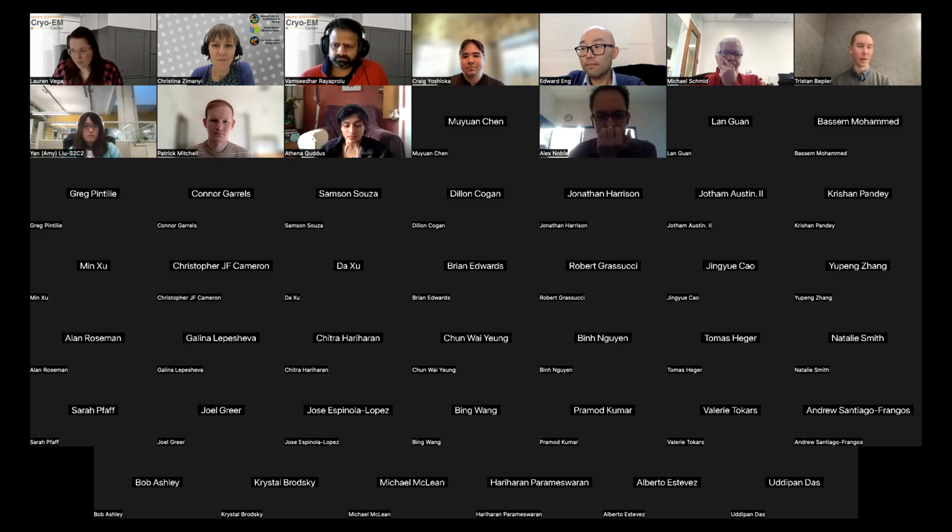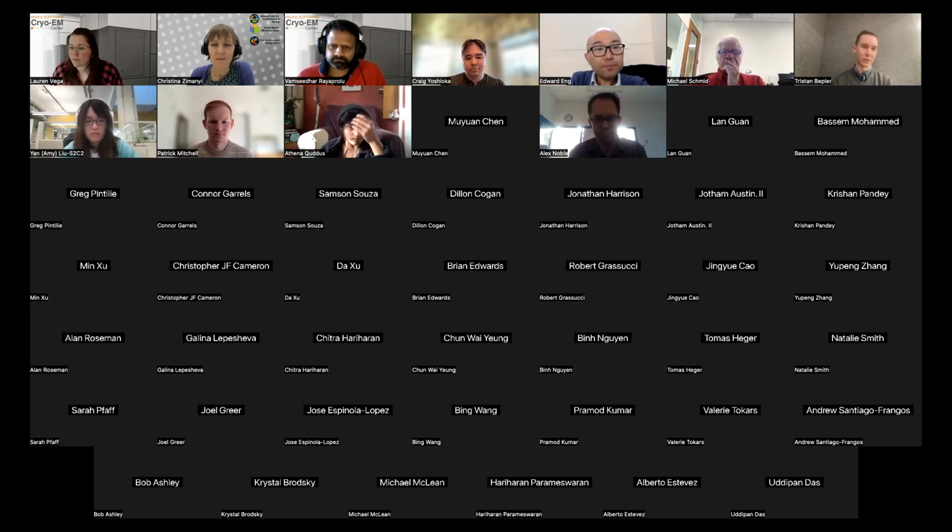In principle, we probably could, but Topaz does have a general picker. I think that works fine if you're doing very standard particles. If your particle is not a very standard particle, you need to train the network. We don't have a way right now to train the network fast enough for it to make sense in an on-the-fly processing setting. Maybe you could label particles on your first couple of micrographs, train a network, and then take that network and automatically annotate the rest. If you're still collecting, it could run on those.